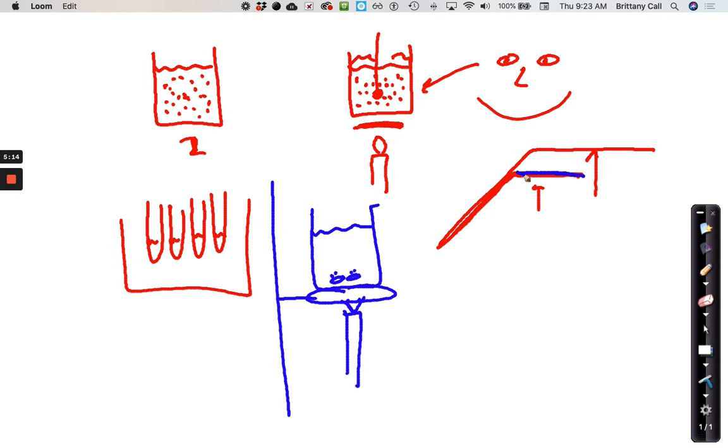Now it gives us a reminder about the thermometer. Remember to support your thermometer so the bulb is submerged but not touching the bottom. We're going to set this up so that thermometer comes right in, right about there. It's right in the middle, not touching the bottom, but it's not toward the top so that it feels the air. It's inside the water all the way. Good? Question? Are we timing it the whole time, or when do we start the 2-minute time?